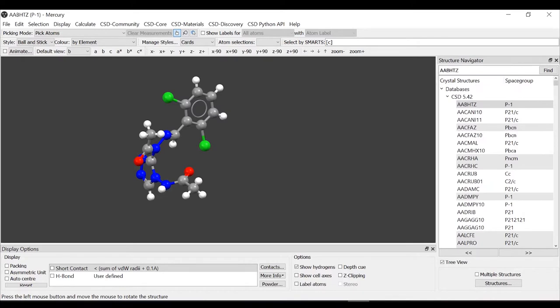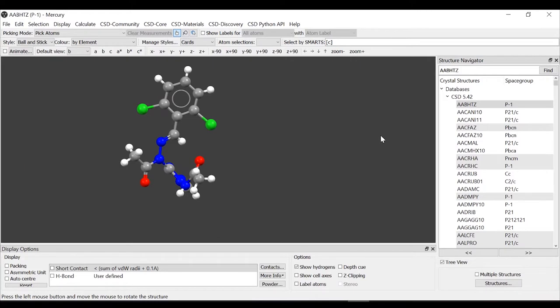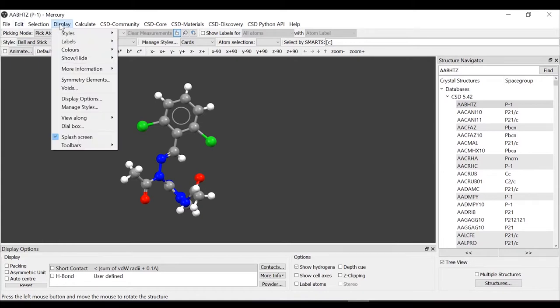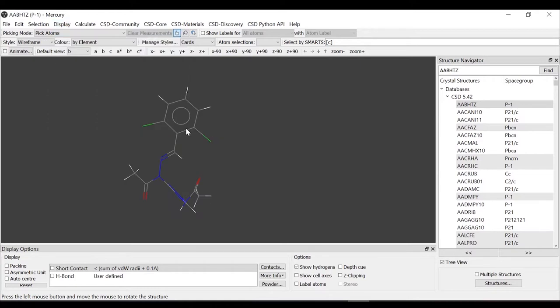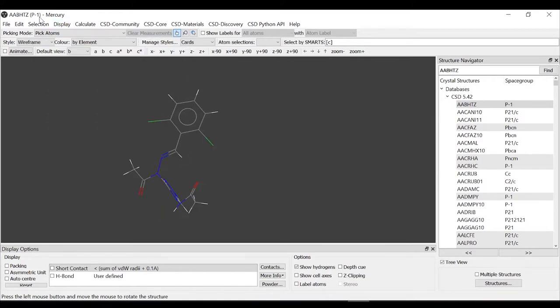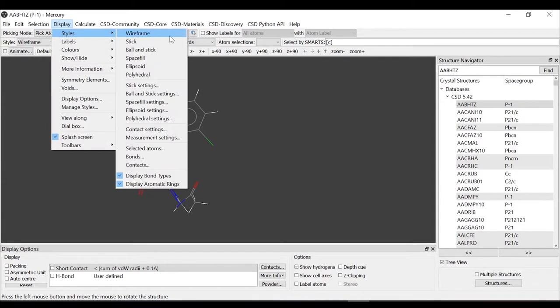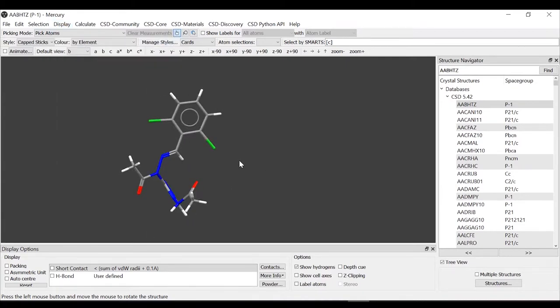The first thing we want to do is to see how we can change the style for this representation. We saw before that there are different ways to do it. The first thing we do is go to display styles. We see the list of styles appearing here. The first we try is the wireframe. Let's try again, display styles, let's try stick. We can see that in this style drop-down menu it's called cap sticks.